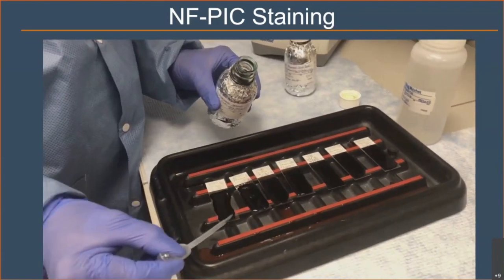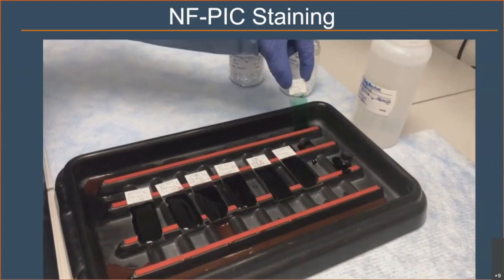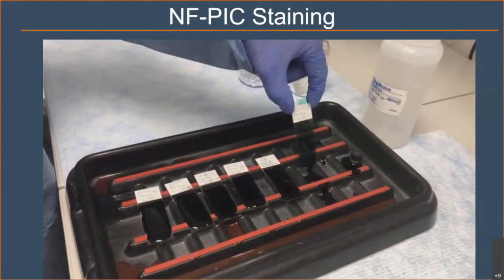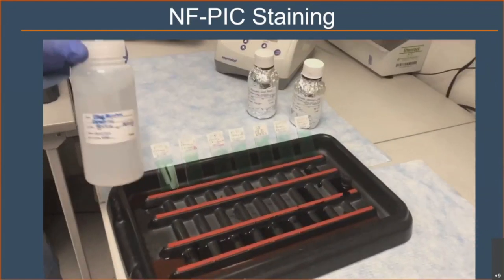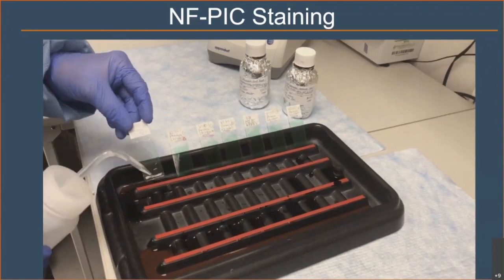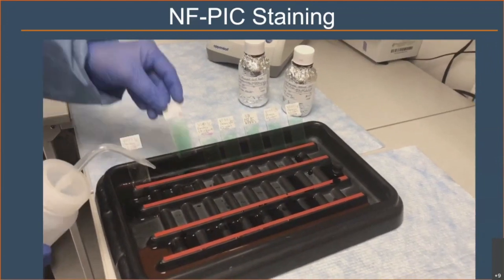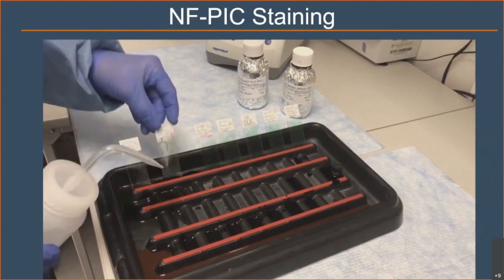At the end of the staining, the excess of the stain is drained and the slides are next washed with ethanol to remove the excess of the stain. The slides are allowed to air dry and then they will be cover slipped and ready to be observed under a bright field microscope. Next slide, please.